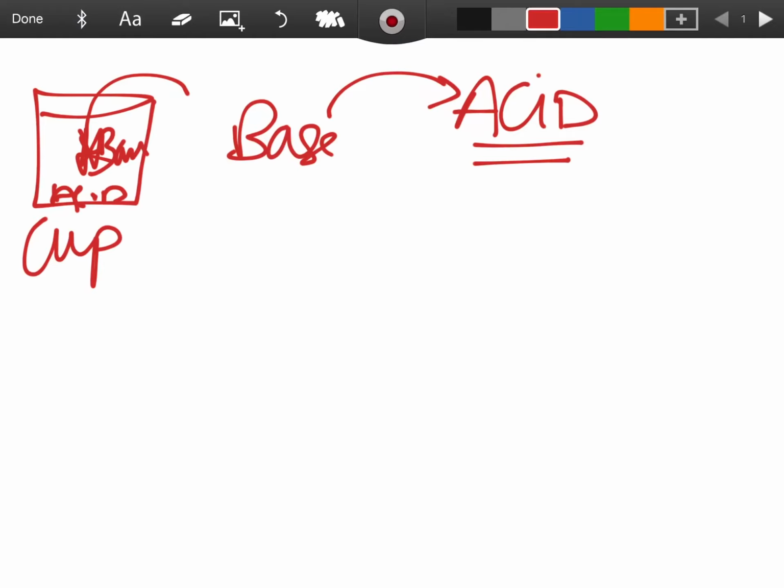Now, if you were using a burette to measure base, then do you remember what you have to do at the start? You have to measure the temperature of the acid and the base separately. So if we take the actual example that I'm using, 2013, they said that the acid was 13 degrees Celsius and that the base was 15 degrees Celsius at the start, before they were mixed together, okay? Now, one thing to say there maybe is that you would use the same thermometer to measure the acid and the base beforehand. Sometimes the graduations in the thermometers, there can be inaccuracies.